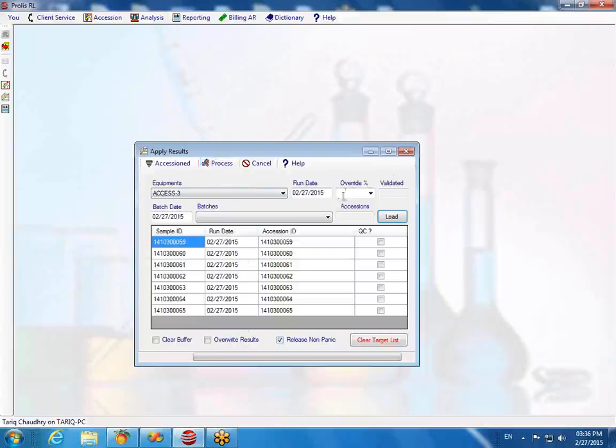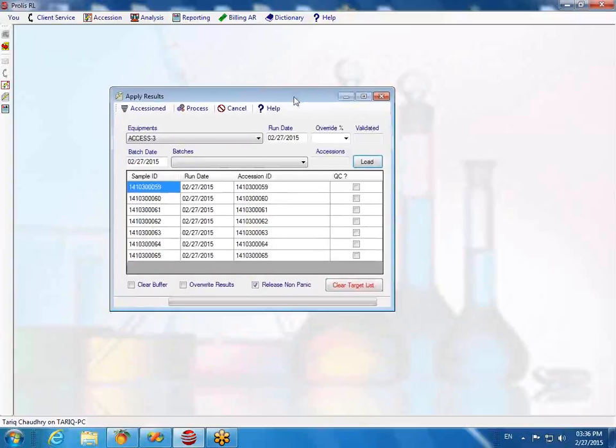So how big will the process be? I'm sorry? How big a server do you need for all this process? You only need a good server as a database server. Or if you want to have a web server, you buy Outreach, then you can use the same server as the web server also, or some people buy a separate machine as a web server.